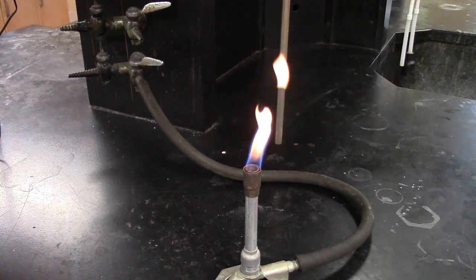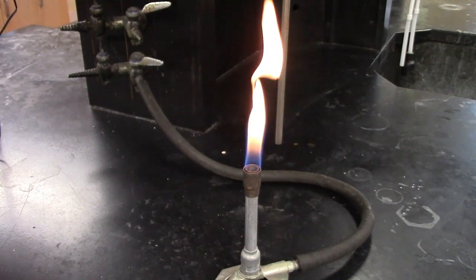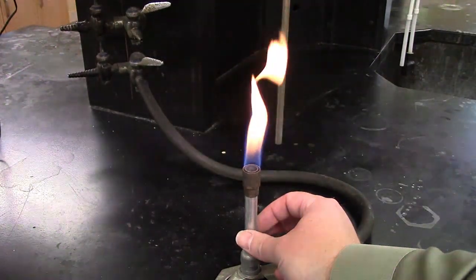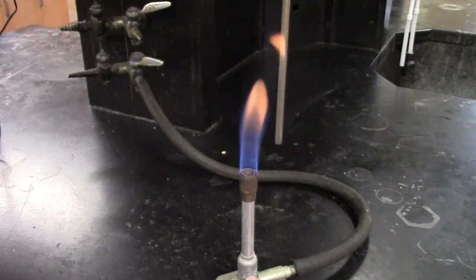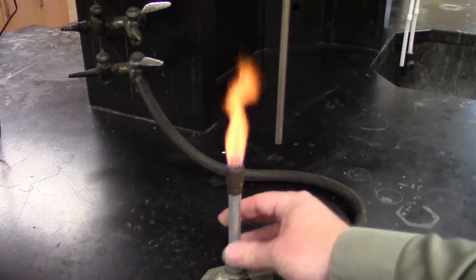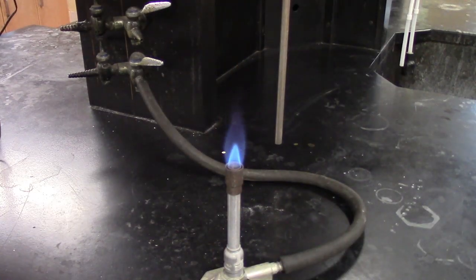So in this case, you can see there's blue down at the bottom of the flame, and it's very orange or yellow up at the top of the flame. We want a blue flame. The orange or yellow indicates incomplete combustion, which means we don't have enough oxygen. So we can twist this top part of the Bunsen burner to get more air in at these vents down at the bottom. And so now we're getting much more air in, and so now the entire flame is blue.